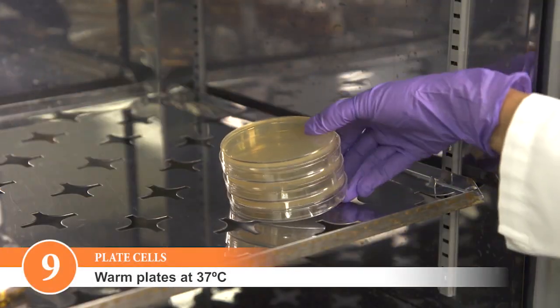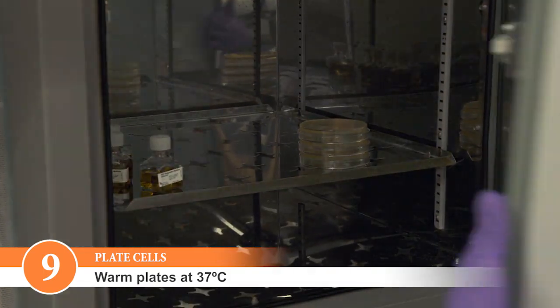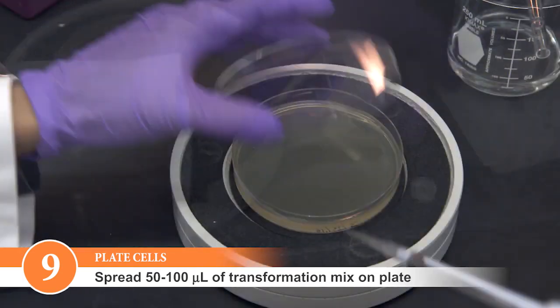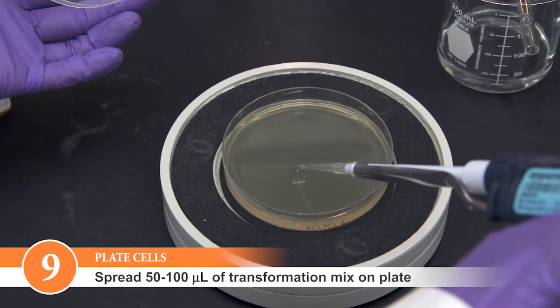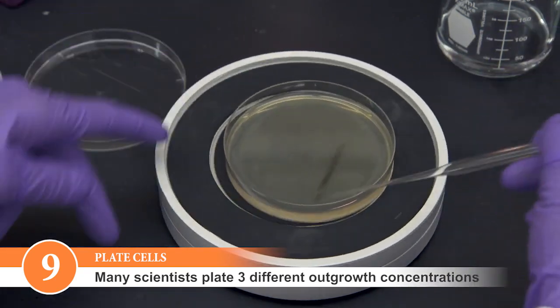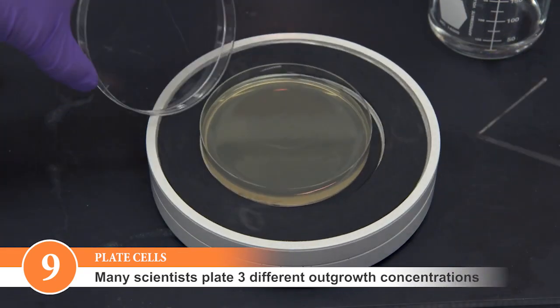Warm selection plates to 37 degrees Celsius. Spread 50 to 100 microliters of the transformation mix onto the plates. Many scientists choose to plate three different outgrowth concentrations to ensure optimal colony counts.